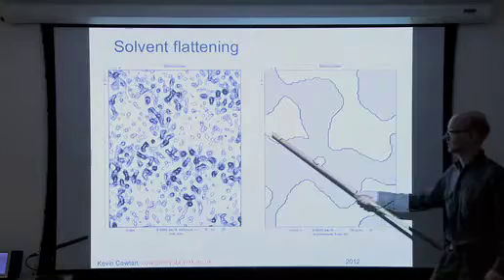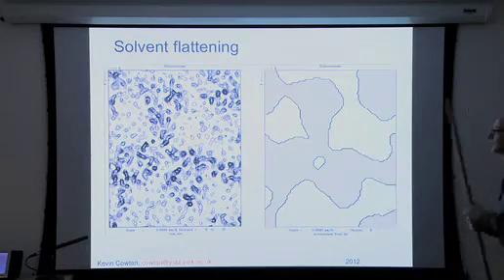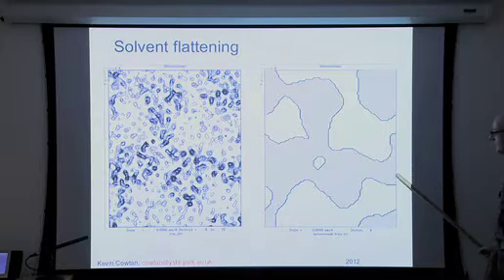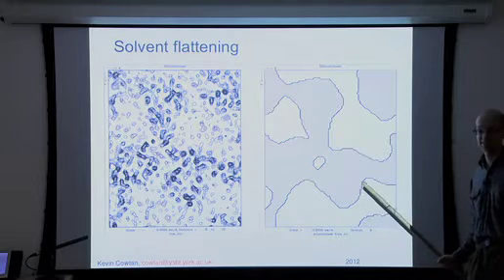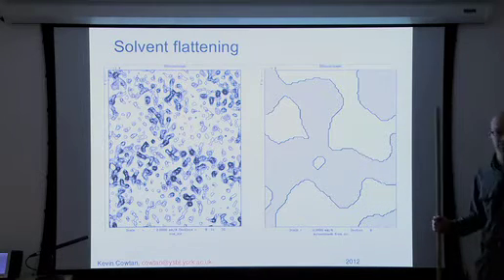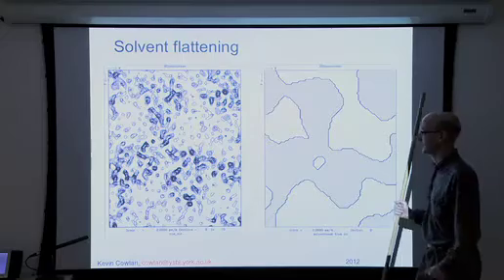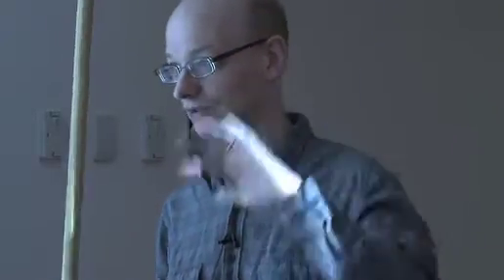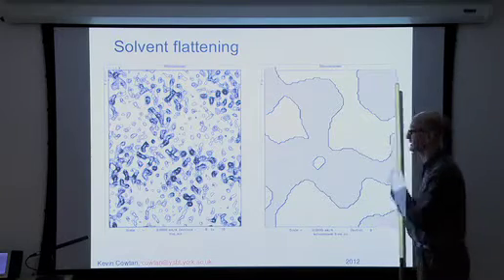The solvent is disordered, and therefore we don't see much in there. So from this, you could draw a mask, an envelope, dividing the unit cell into protein regions and solvent regions. That's fairly easy, even from a fairly poor initial map, and is done completely automatically.